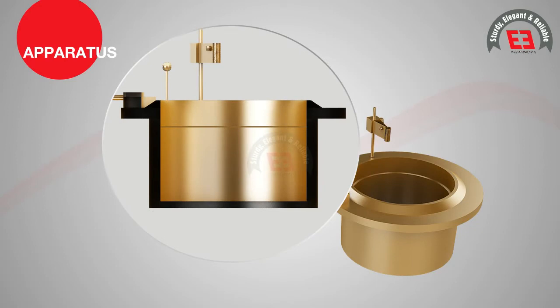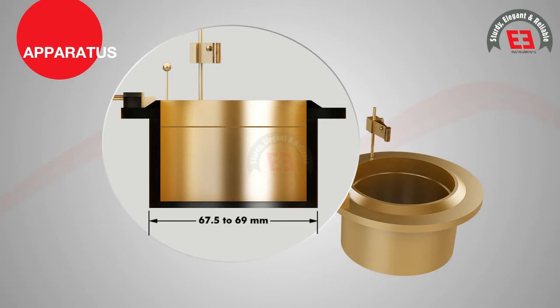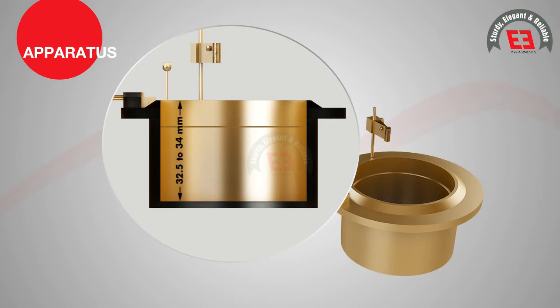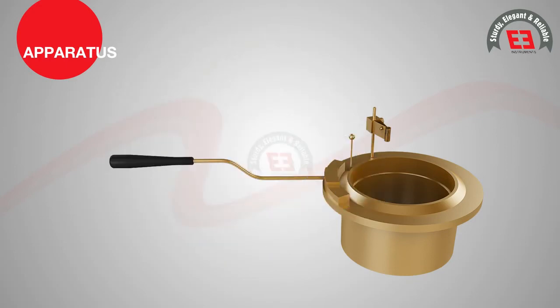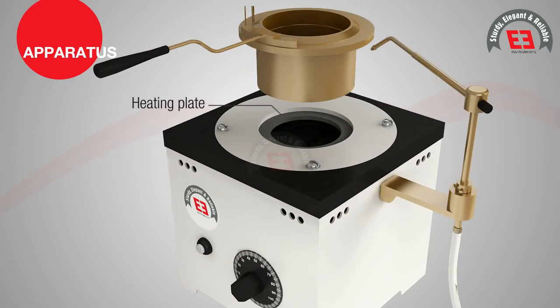The inside diameter of the cup is between 63 to 64 mm. The outside diameter of the cup is between 67.5 mm to 69 mm. The filling mark is between 9 mm to 10 mm from the top of the cup. The inside height of the cup is between 32.5 mm to 34 mm. The heating plate is of sufficient dimensions and material to ensure that thermal heat to the test cup is applied only to the bottom of the test cup.